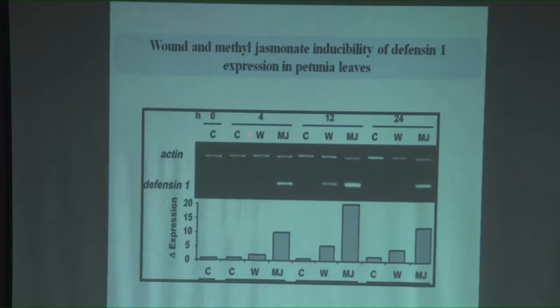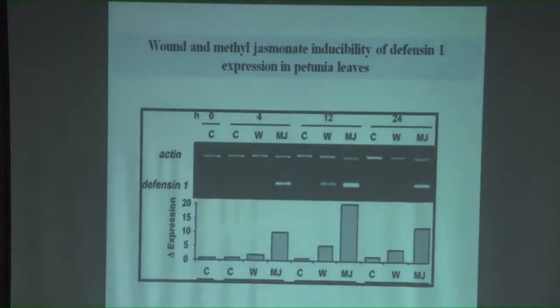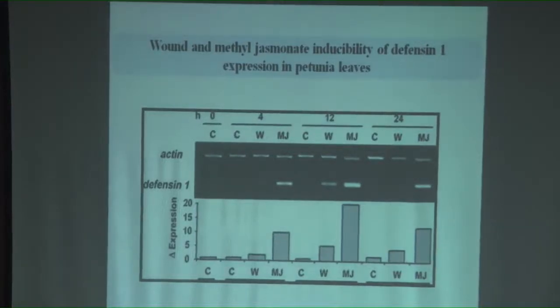So, you isolate mRNA from this sample, this sample, this sample, you convert them into cDNA, run the PCR, stop at a particular point, add ethidium bromide, load it on gel and see what is the difference in the end product. You see this kind of difference, and the machine is quantifying this. Okay. The machine, what is called not real time, I am not talking about real time now, the normal transilluminator, gel doc, will read the intensity of each of these bands, and then it will quantify and show you the histogram, right, and you can easily see the difference in the gene expression.